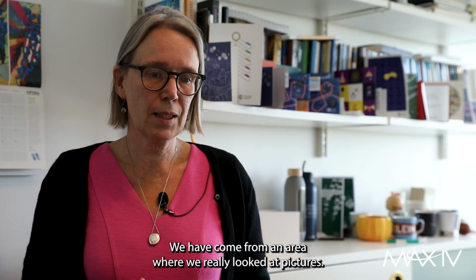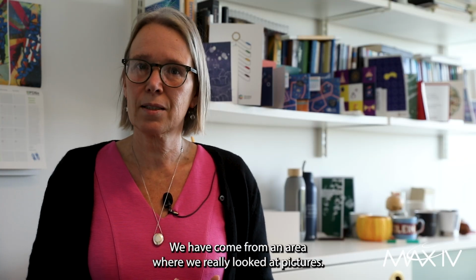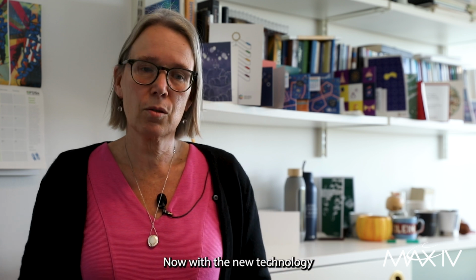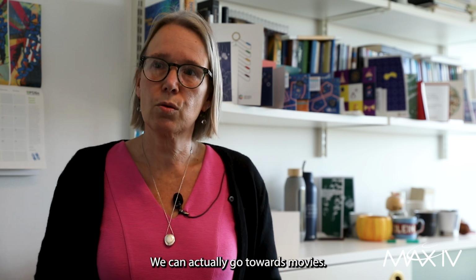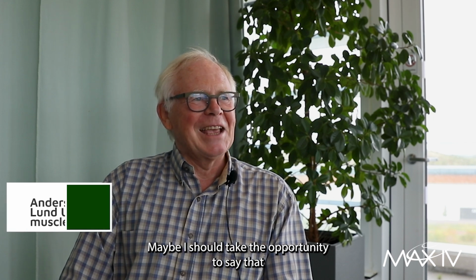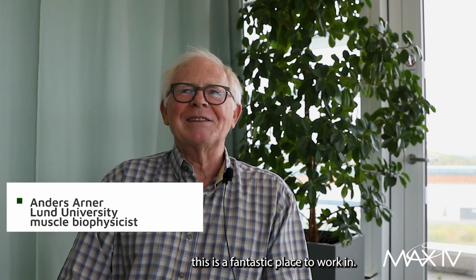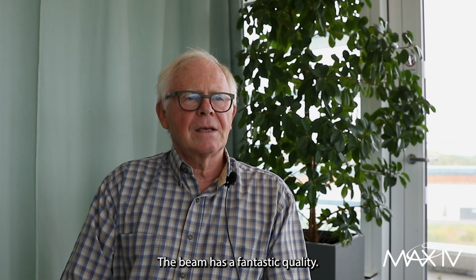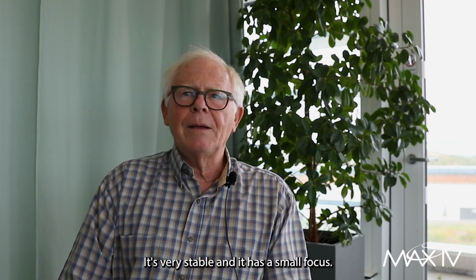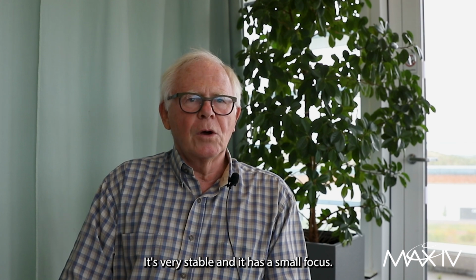We have come from an area where we really looked at pictures, static pictures. Now with the new technology, we can actually go towards movies. Maybe I should take the opportunity to say that this is a fantastic place to work in. The beam has a fantastic quality. It's very stable and it has a small focus.